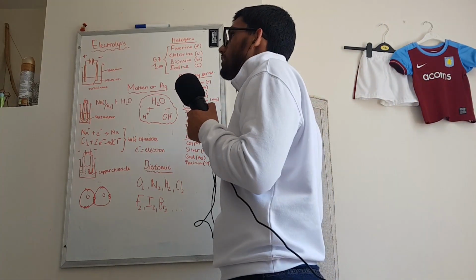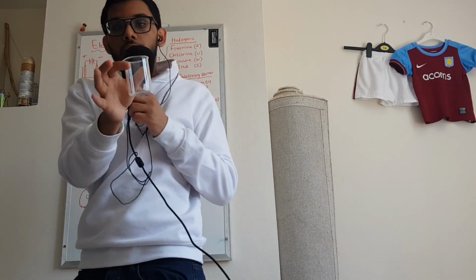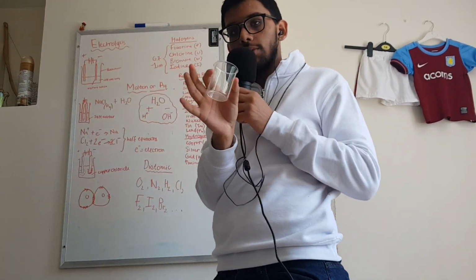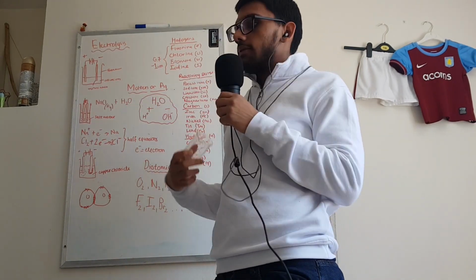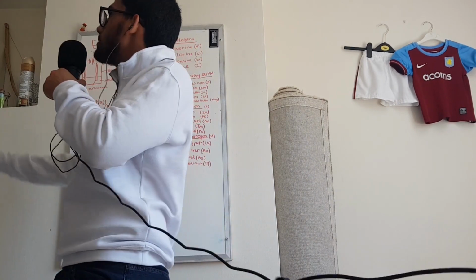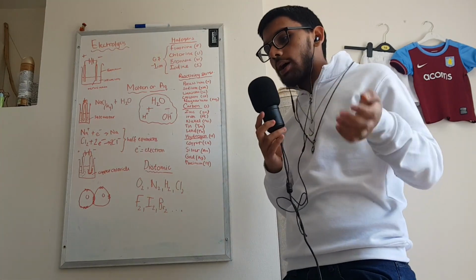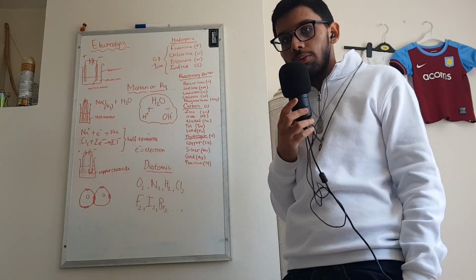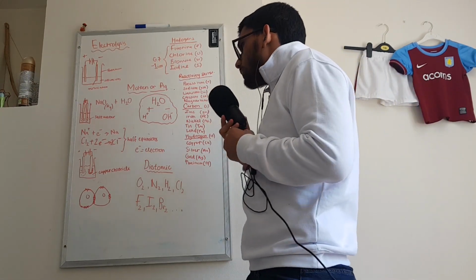You just need a beaker. You can get any bog standard beaker. I have a little beaker here. If I fill this with salt water and then put 2 electrodes in there and run electricity, eventually it'll begin to form bleach. If you want to do this, I suggest not using just table salt or Himalayan salt. Use salt water from the ocean. The reason why is because normal table salt will have caking agents in it, which may affect the reaction. So you kind of want the purest salts.